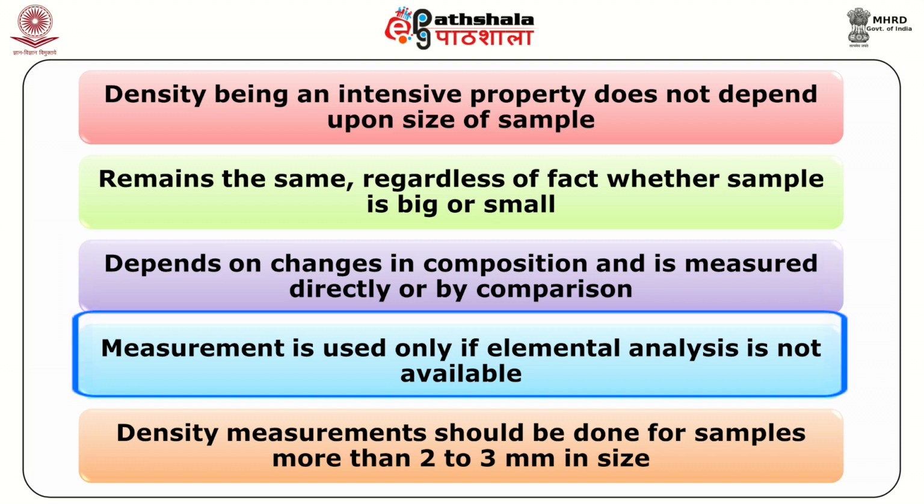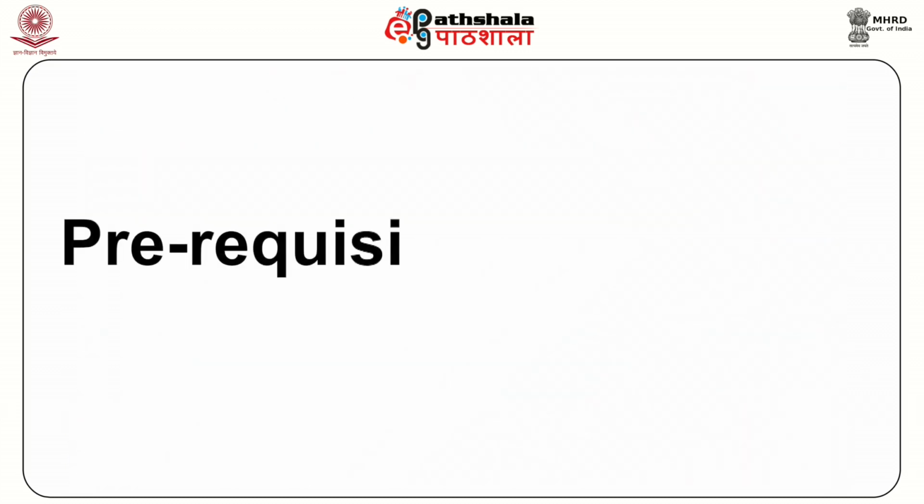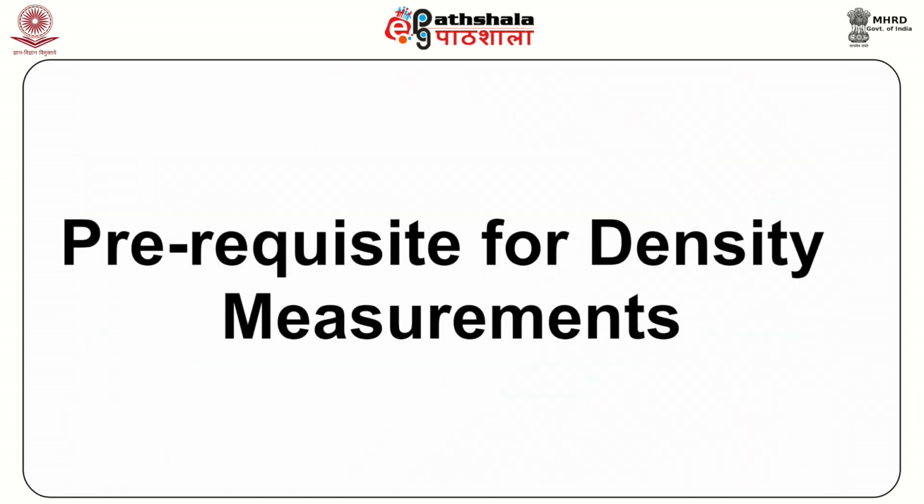This measurement is used only if elemental analysis is not available. Density measurements should be done for samples more than 2 to 3 mm in size. These measurements are useful in identifying multiple sources present in the sample. Prerequisite for density measurements.